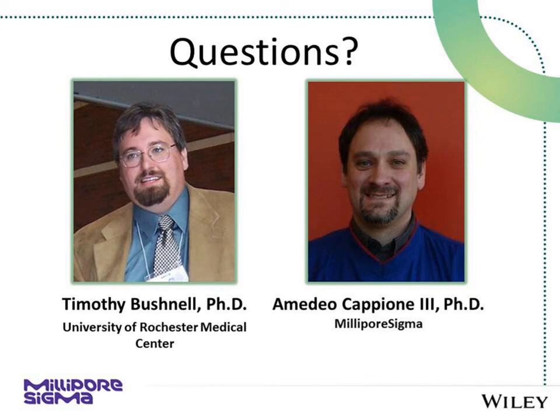Hi, that's a good question, Gwen. I would recommend not labeling it directly in the hybridoma supernatant because all of the other protein content that is in there will basically act as a sink and siphon away a lot of the fluorescent dye that you're using.